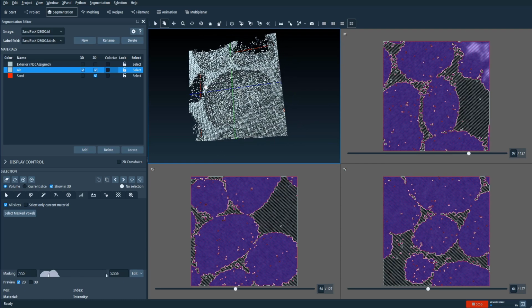And in this particular case, I know that my data set has noise, right? And that noise is causing these unwanted selections over here, and it makes my thresholding tool give me, let's say, not the best results that I can get.